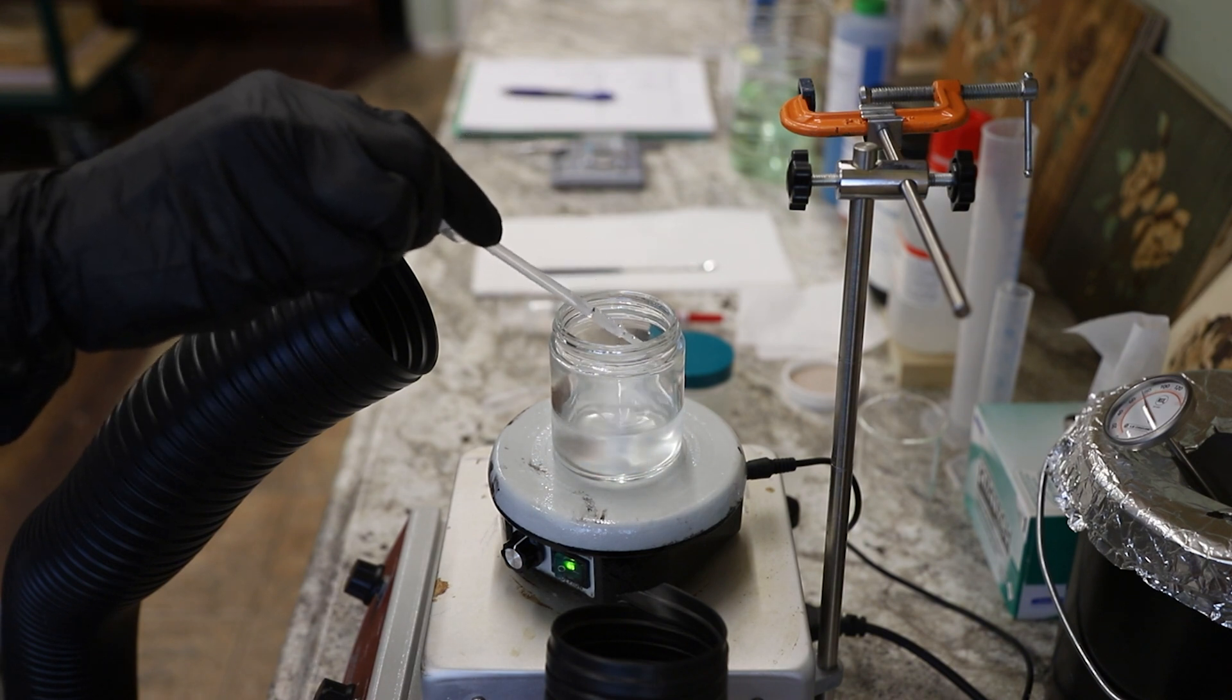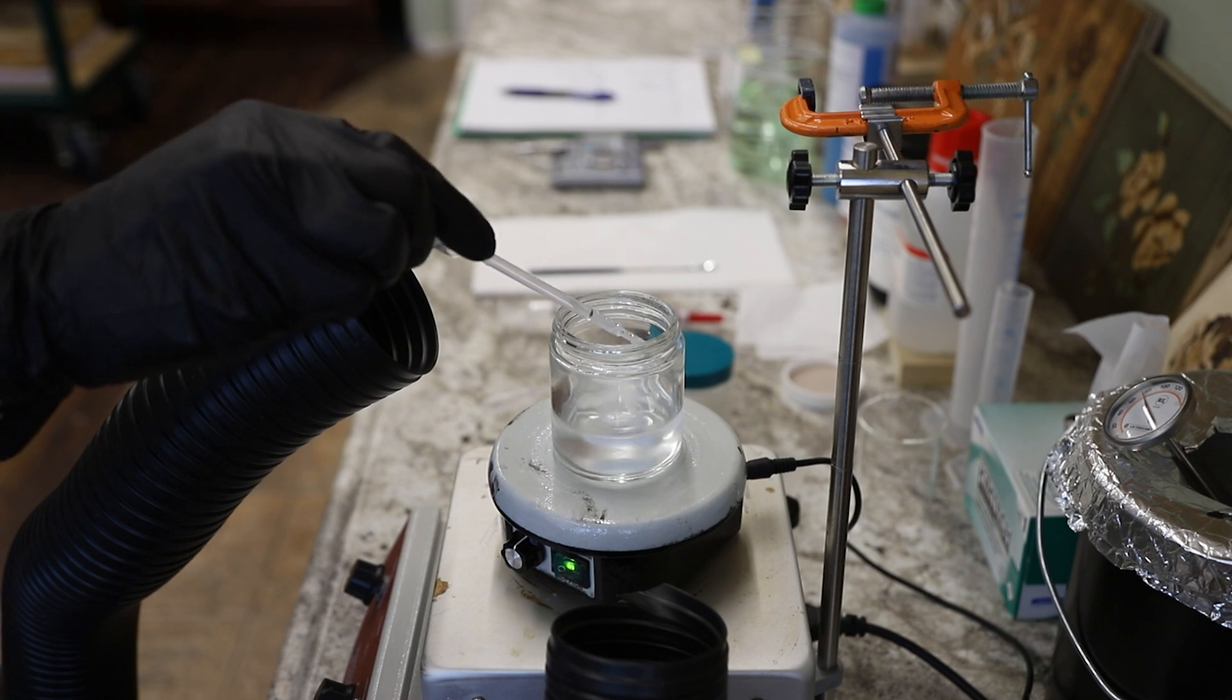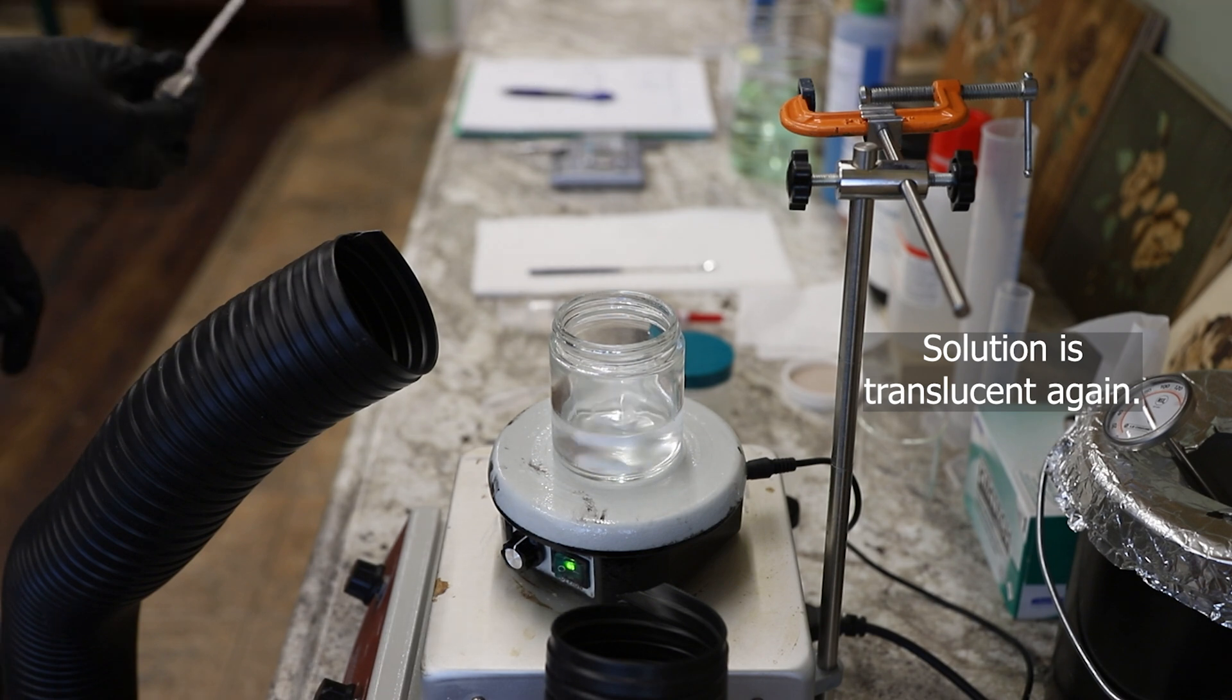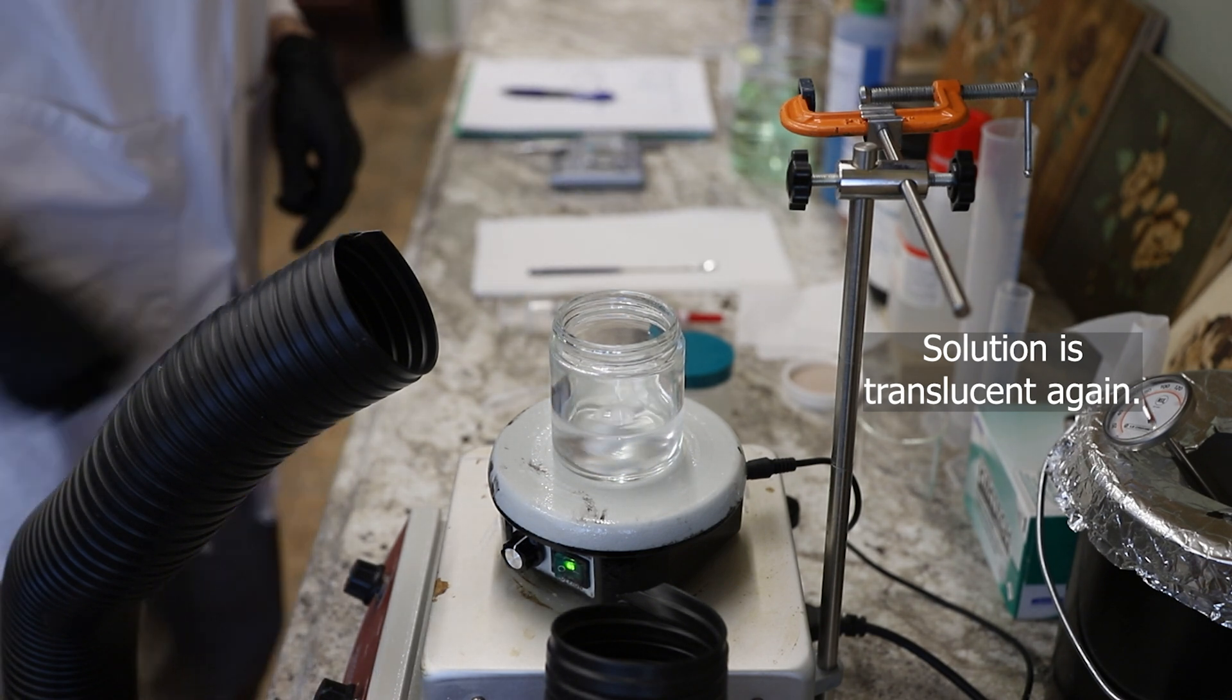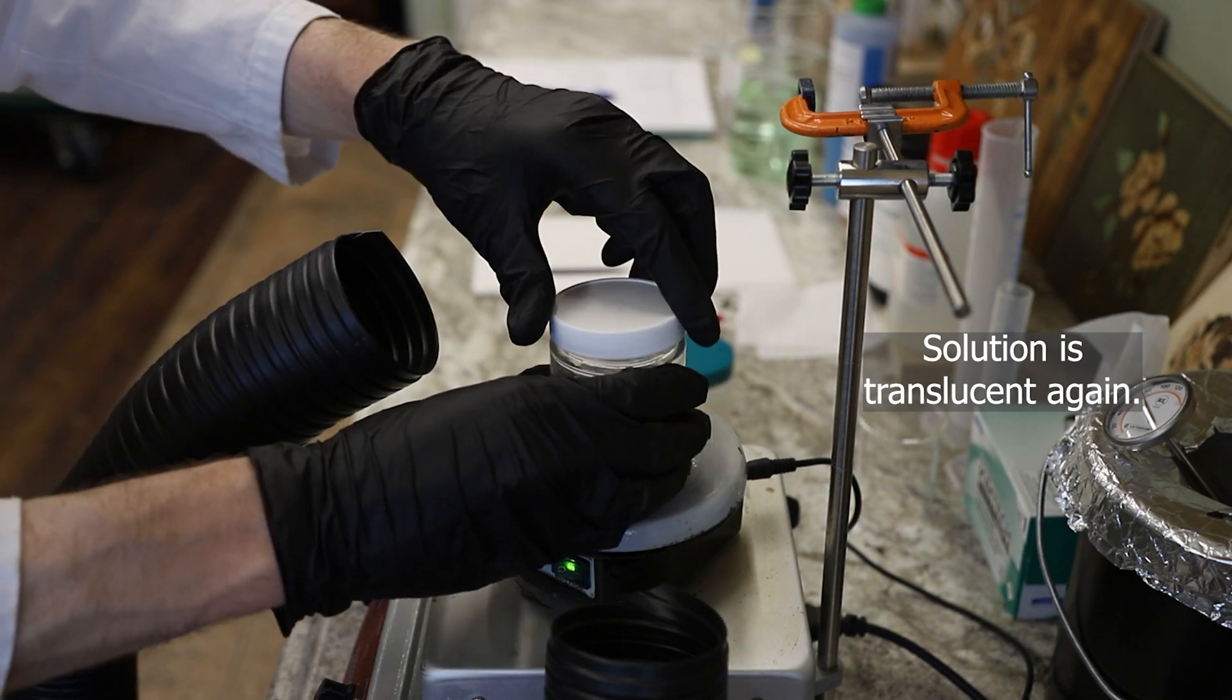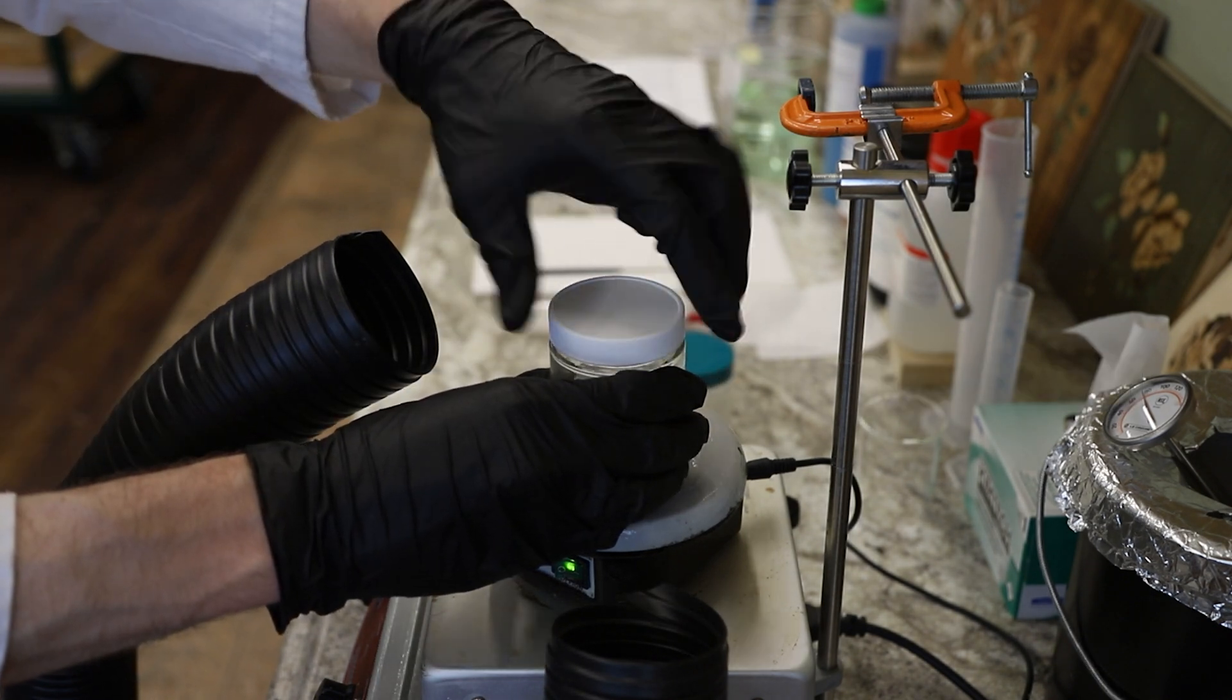Because what you're doing is reducing the concentration of propylene carbonate in the solution. And it's that interaction between the propylene carbonate and surfactant that causes that clouding. So by adding that water, you can bring it right back to translucency.